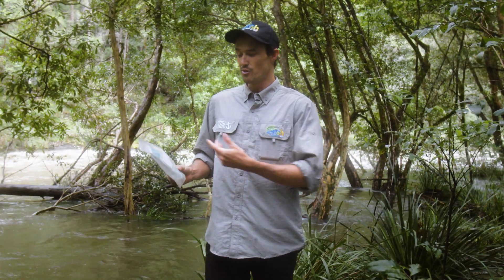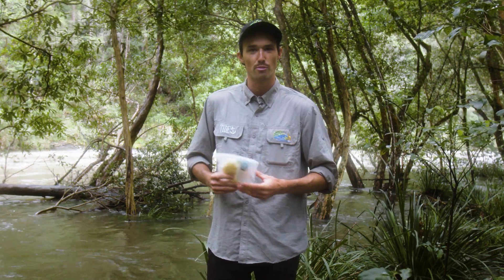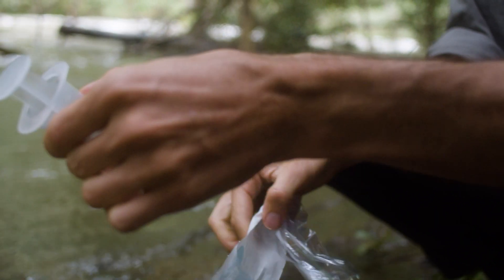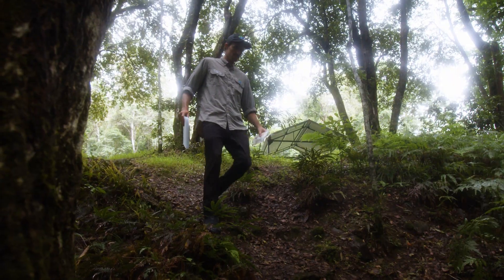G'day guys, in this video I'm going to show you how to use these environmental DNA test kits — how to take a water sample and preserve it to be sent back to the lab for analysis. We're going to be using this technique as a non-invasive way to test for the presence of any elusive or threatened species that would otherwise be really hard to detect in our waterway. I can show you the first steps in how to take a sample.